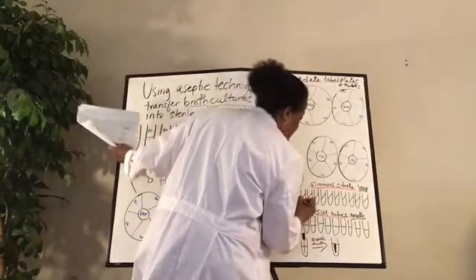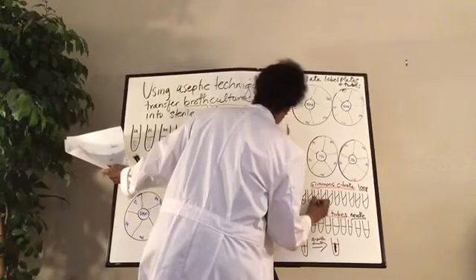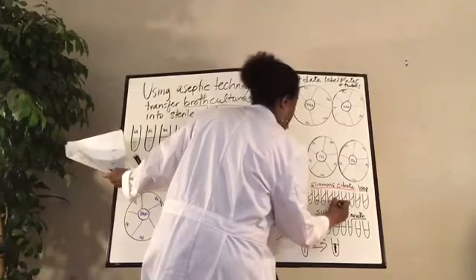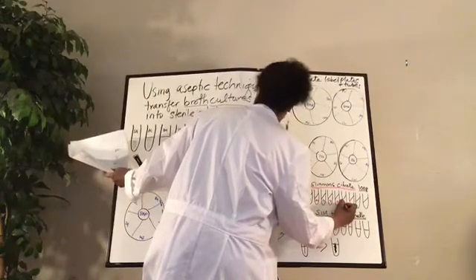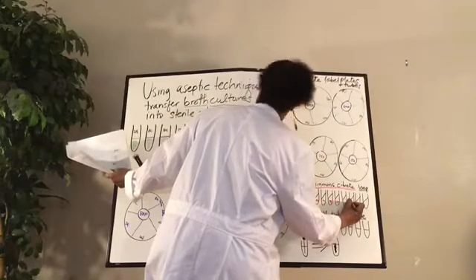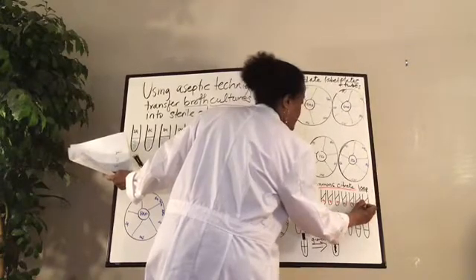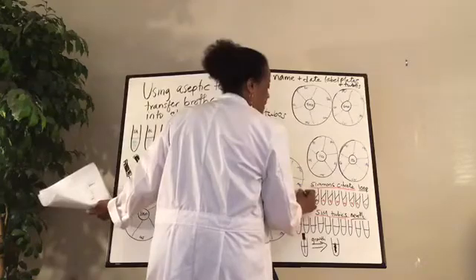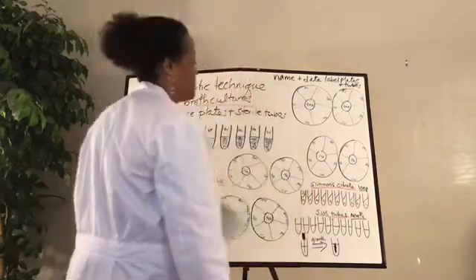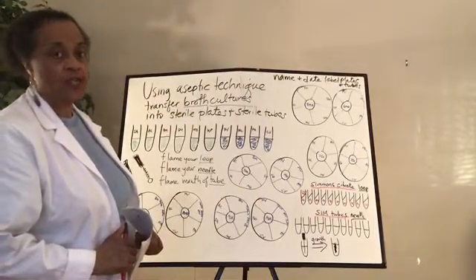We'll say this is the SA, the EC, the BM, the SM, MS, KP, PV, ML, PA, and then the CV. Make sure your name and the date go on here, on all your tubes. Okay, just so that I will know that you know to do that.